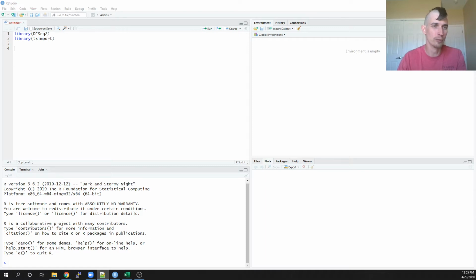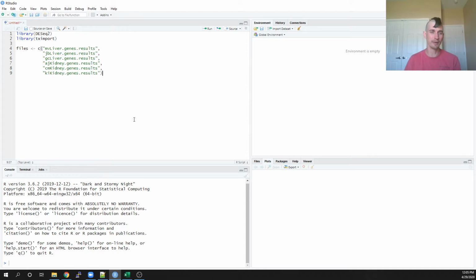I don't know if you looked at the manual and the tutorial about importing file names. It's designed in a way that all you have to do is point to a directory and it will load up all of your files in that directory as needed. However, it's a pain to make that work. It's a little trickier than it really has to be.